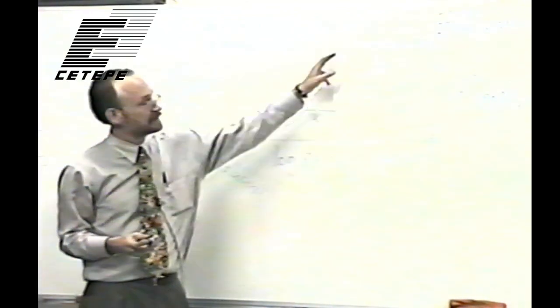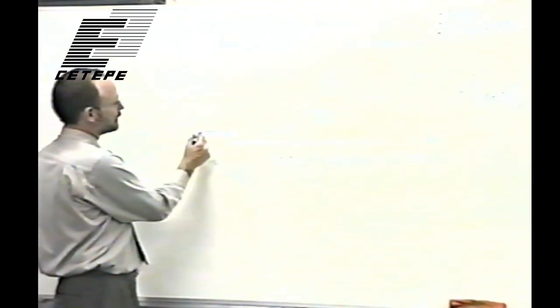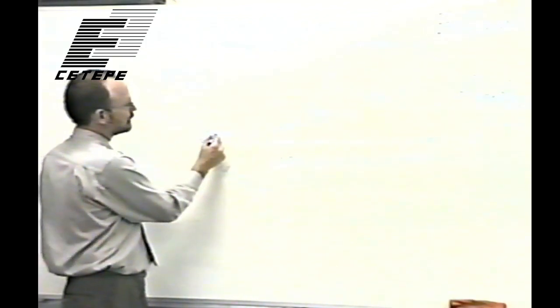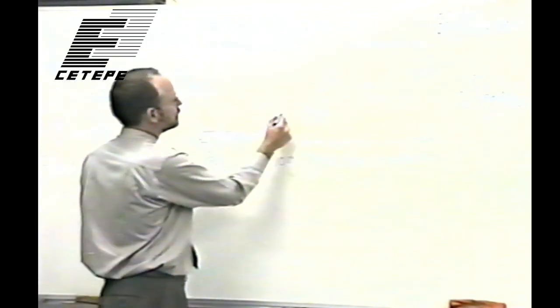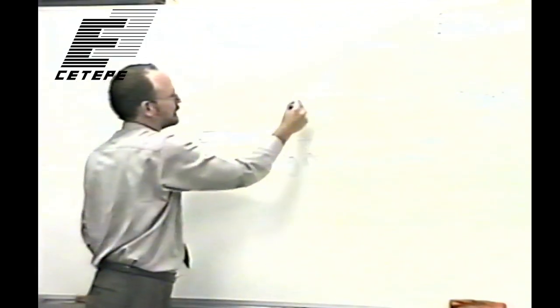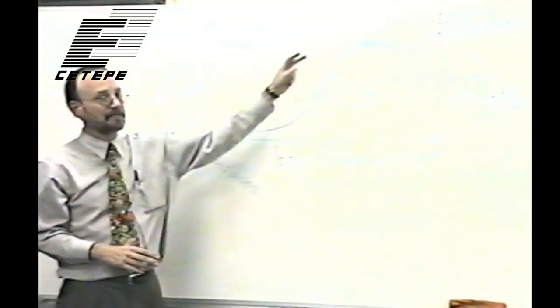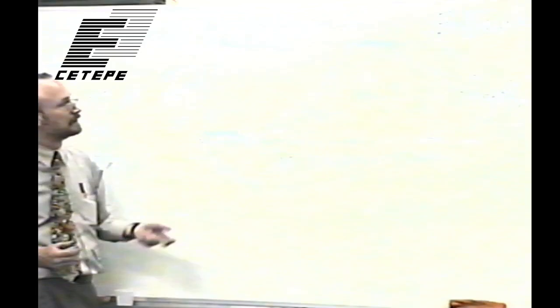This film here has a relatively high contrast. We could have another film whose H&D curve looked like this. This film has a lower slope, and so it's lower contrast. It takes a much wider range of exposure, between dark objects and light objects, to show the same amount of change in the darkening of the film.